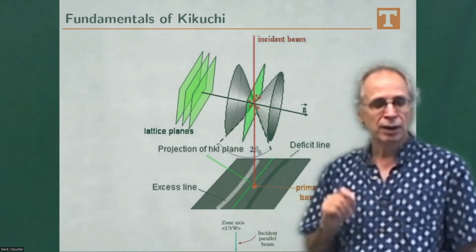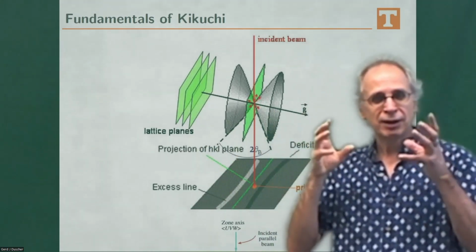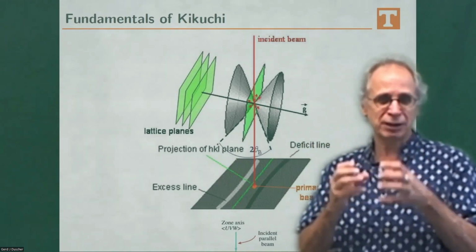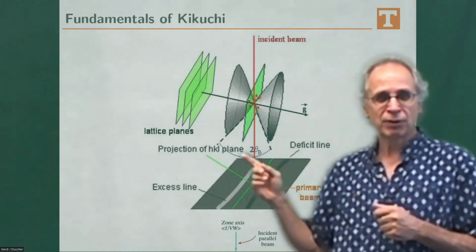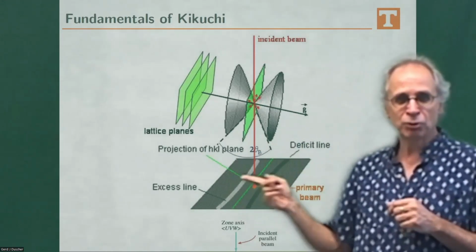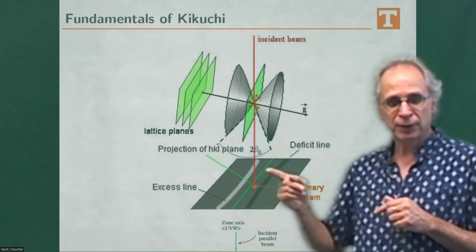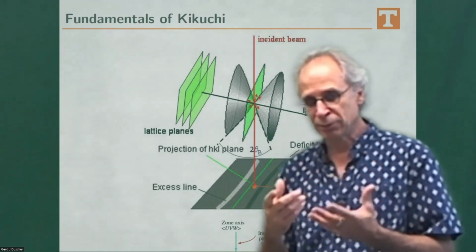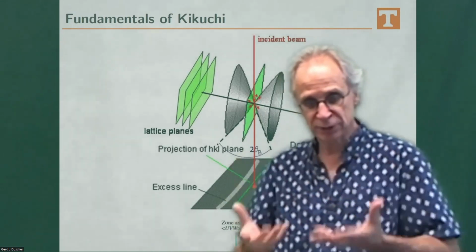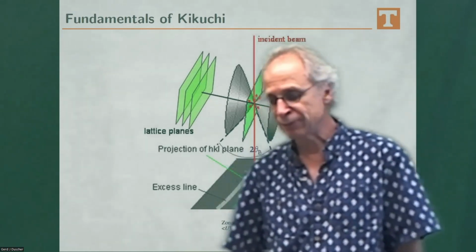The beauty of it is that it is like a diffraction pattern where the origin is inside your sample. That means they are fixed to your sample and nothing can change that. And so we use that to orient ourselves in reciprocal space, and they're extremely useful. They're always in your 4D STEM diffraction pattern, so it hits your detector in one way or the other.